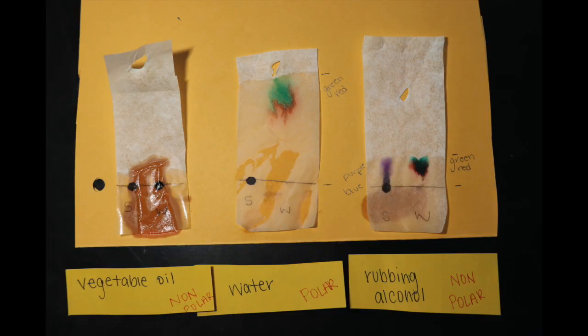The vegetable oil is nonpolar, so it doesn't move the Sharpie ink or the washable marker. So we can assume that because the vegetable oil has a different polarity, it's less nonpolar than the Sharpie marker, and it's not enough to pull the Sharpie ink apart.